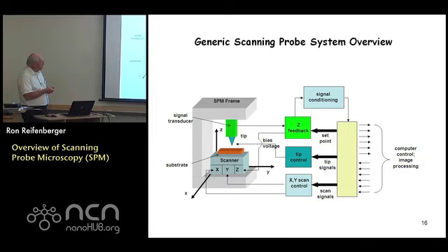You're also going to have an XY scan control. So these are the scanning signals that are going to move the sample in X and Y while you record Z. So you have to be able to interface with the software that's been written. And the advantage of doing it is you get these beautiful three-dimensional images of samples at length scales that are tens to hundreds of nanometers in extent.